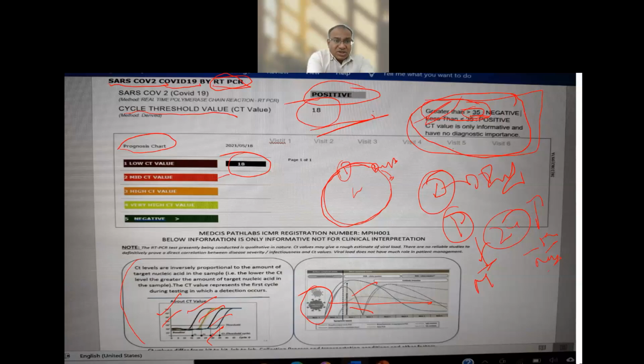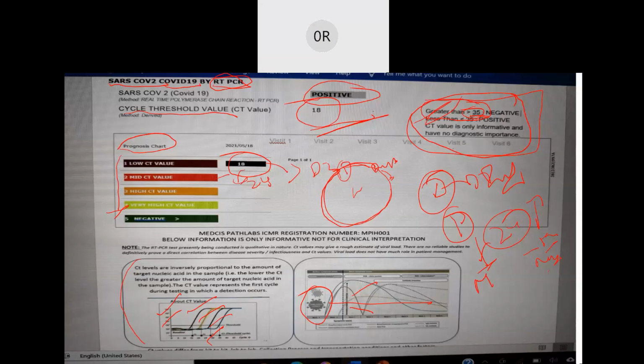See here, at these four points on this prognostic chart. Did you see the prognostic chart here? The person who is affected has been given a drug regime for the treatment. Then when they repeated the PCR, he showed a value of 24. Don't you think the patient's prognosis has improved? The load of the virus has come down. Yes, sir, the value has decreased.